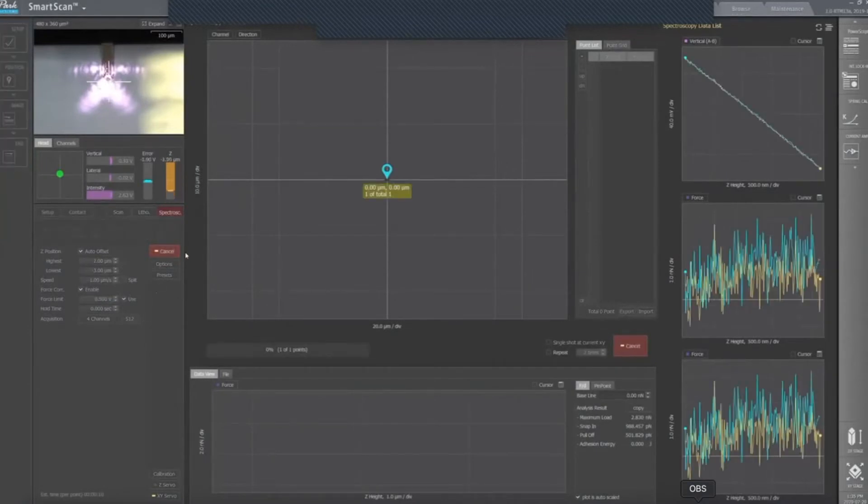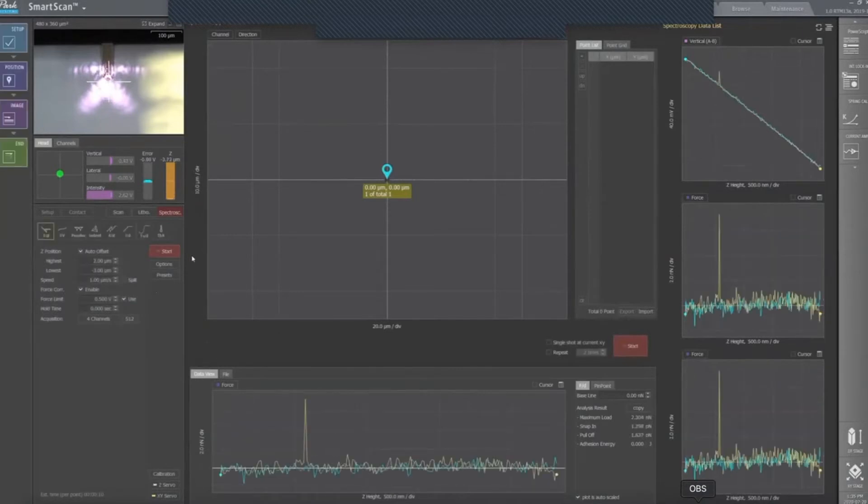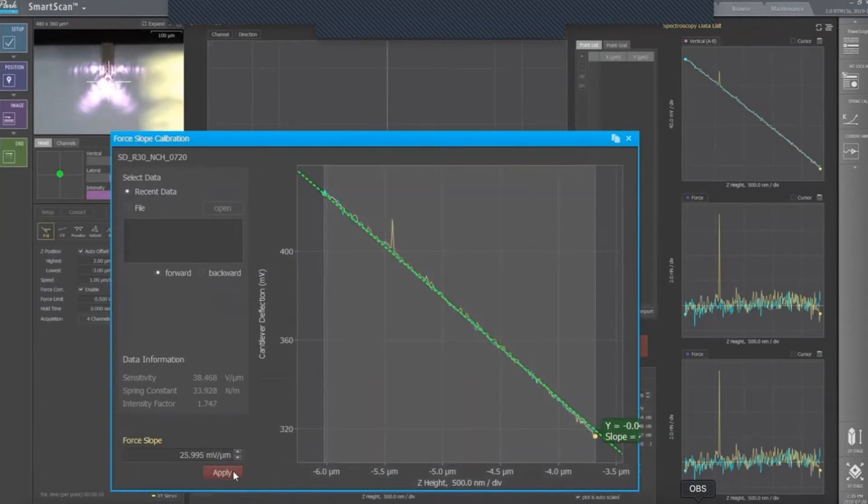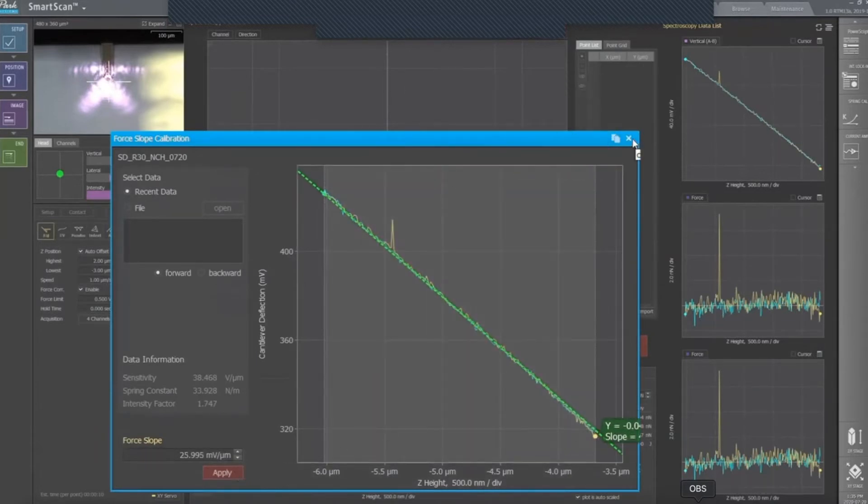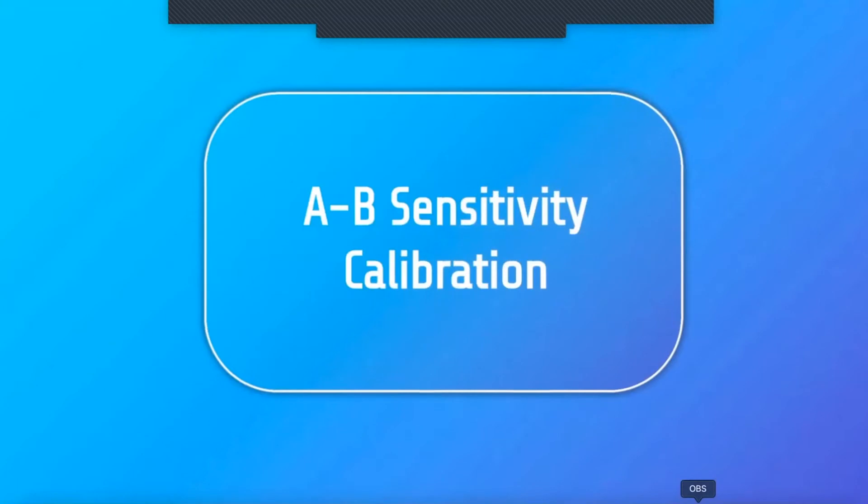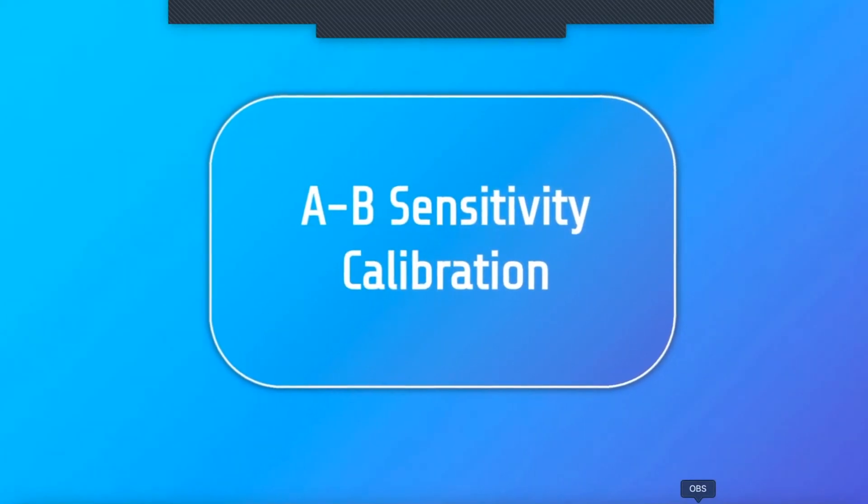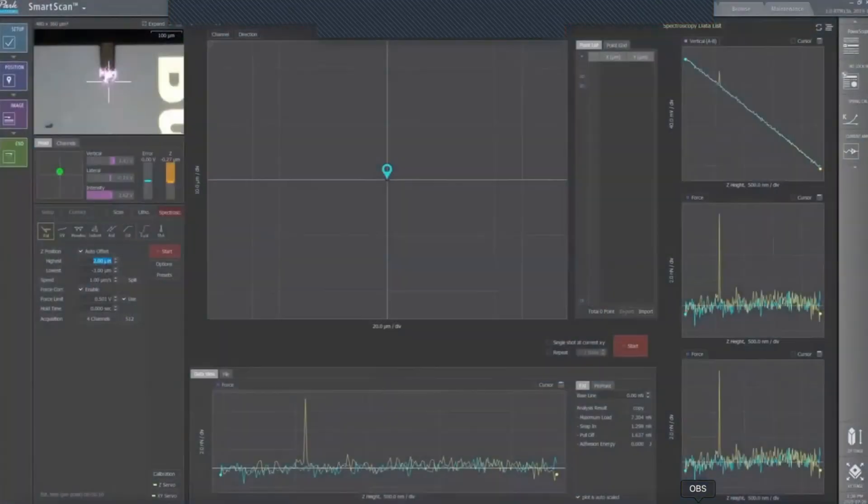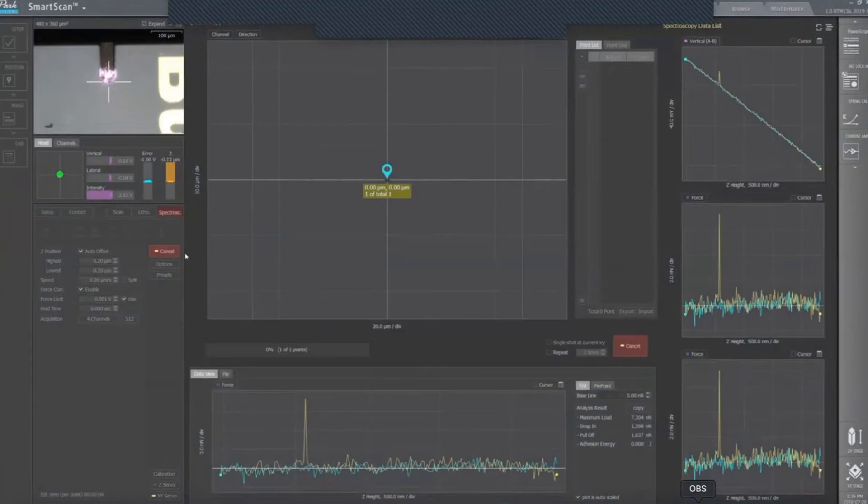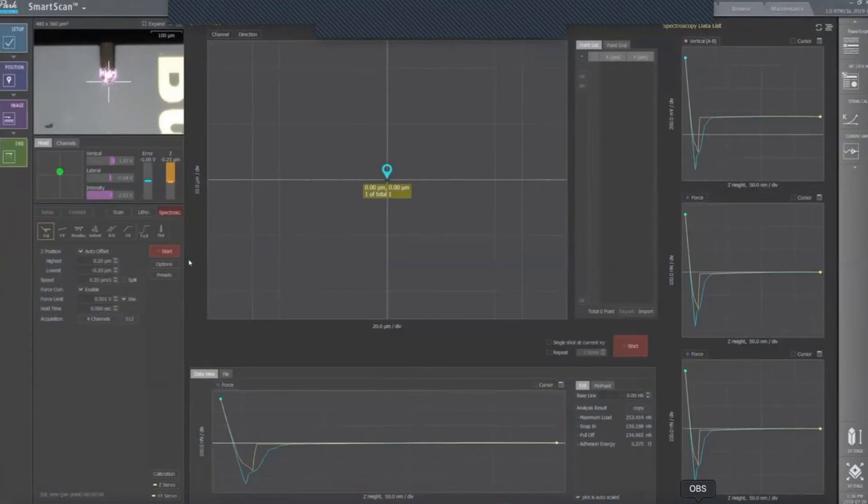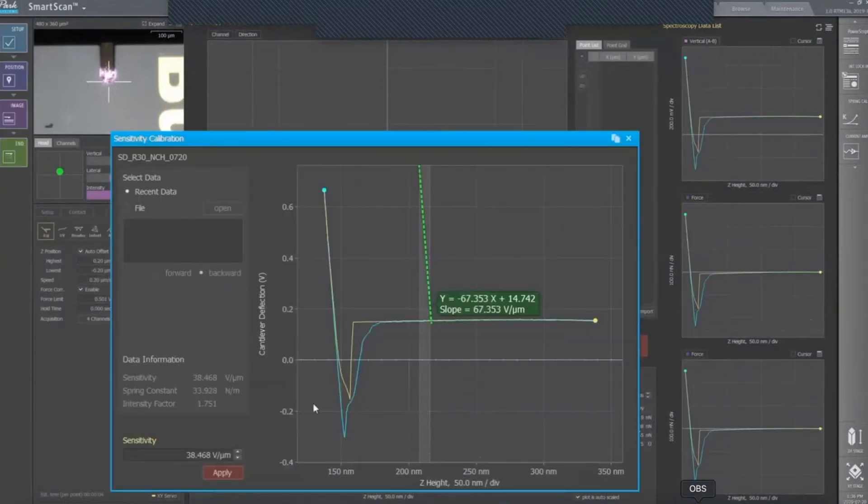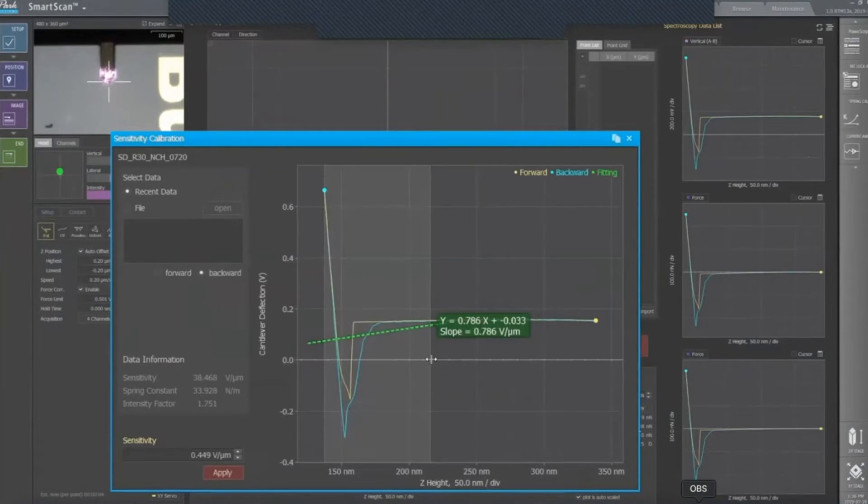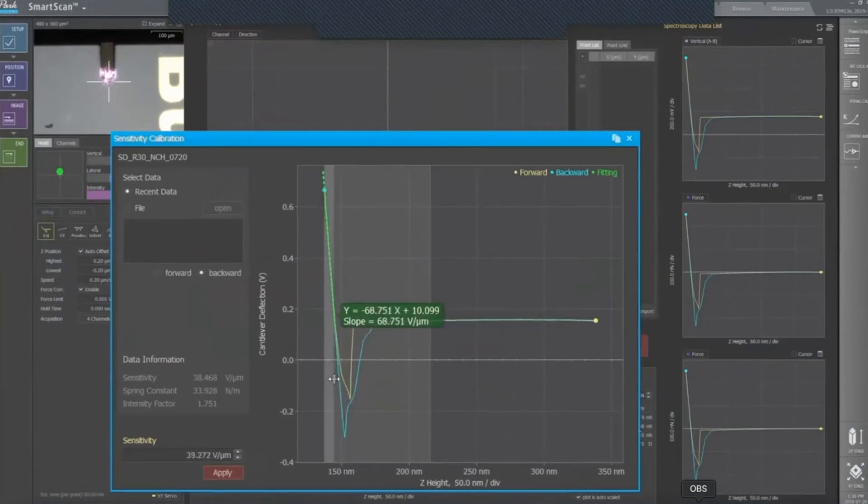The next step is the A-to-B sensitivity calibration, which determines the factor between the deflection of the cantilever and the movement of the reflecting beam on the photodetector. A-to-B sensitivity is derived from the slope of the force distance curve, obtained in contact mode on a hard sample like bare silicon. The slope of the force distance curve relates to how much the cantilever bends when pressed against the sample surface, and this correlates to the cantilever stiffness.